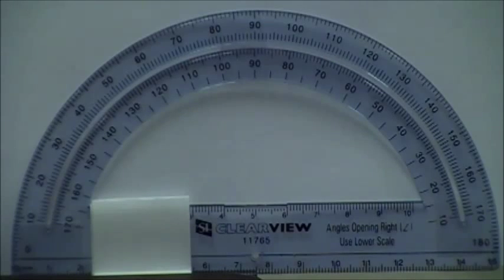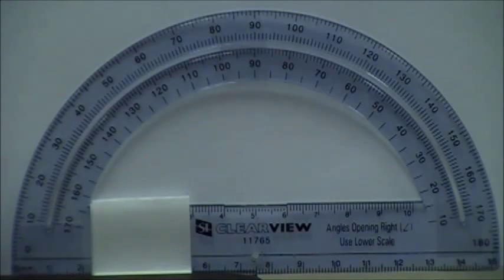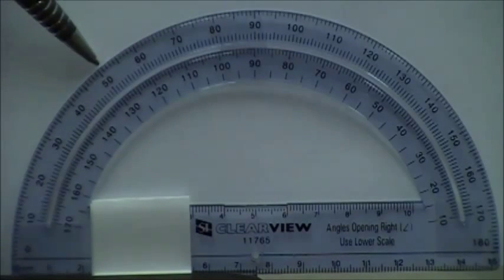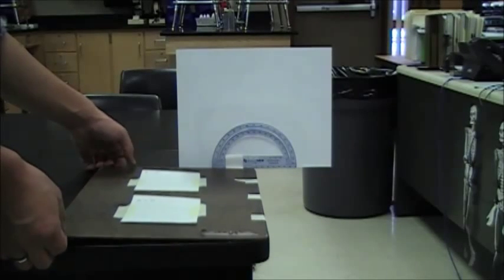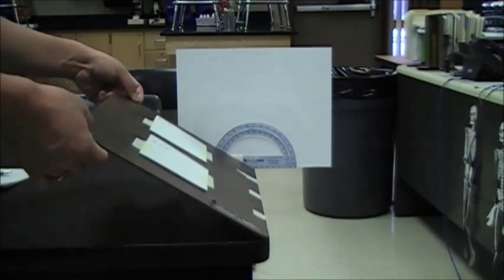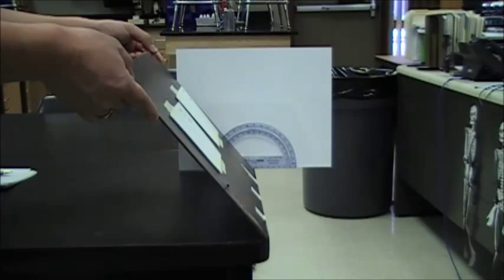To calculate the desired impact angle, the protractor will start at 90 degrees. Next, you'll take your angle assigned and subtract that from 90 degrees. In my case, my angle assigned was 40 degrees, so 90 minus 40 is 50 degrees. Once I've calculated my angle of impact, then I'll raise my whiteboard to that angle, in my case 50 degrees.